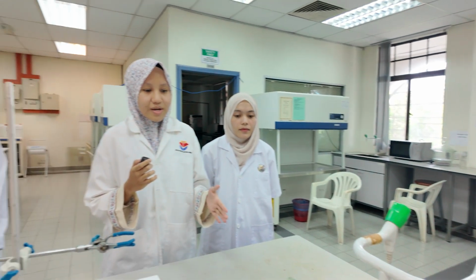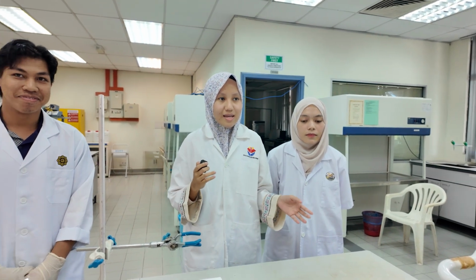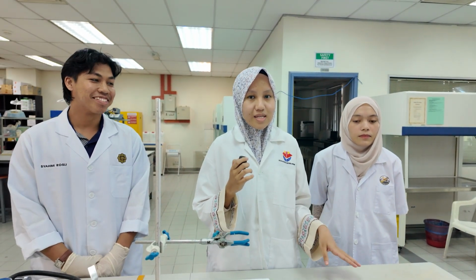Okay, we can use methanol at high temperature, and then we cool it slowly to make sure the compound can crystallize out. Why does it matter? Because some synthesized compounds are not completely pure, so recrystallization helps to isolate the compound to make sure it is a pure substance.